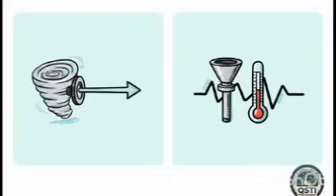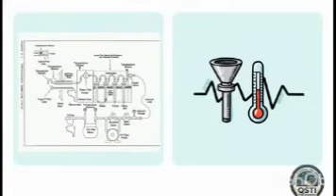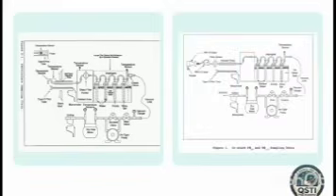Now, Method 201A fundamentally differs from the old, reliable standard, Method 5. If you've run Method 5, you know the whole game is operating isokinetically, right? You're constantly tweaking your flow rate so the gas velocity entering your nozzle perfectly matches the stack gas velocity. But Method 201A totally flips the script. It uses a constant sampling rate.